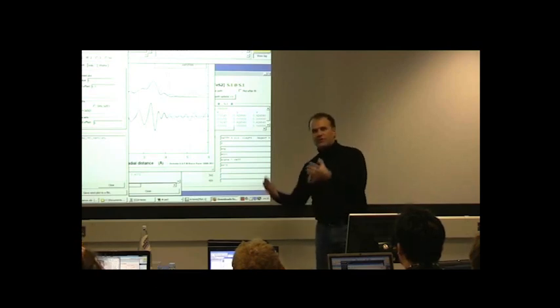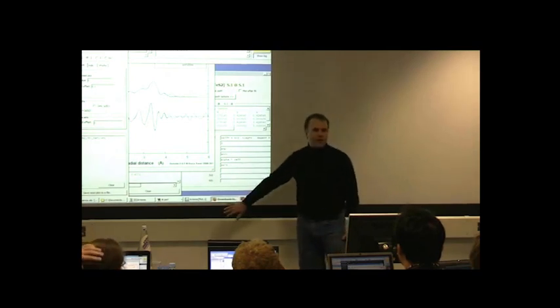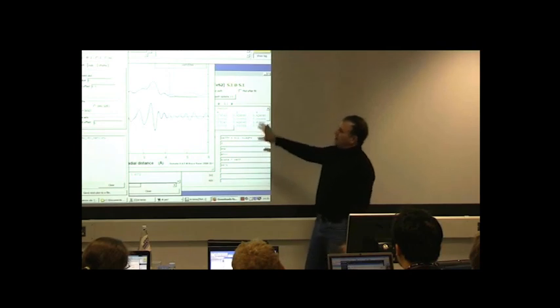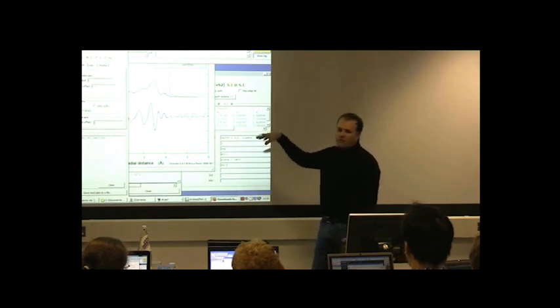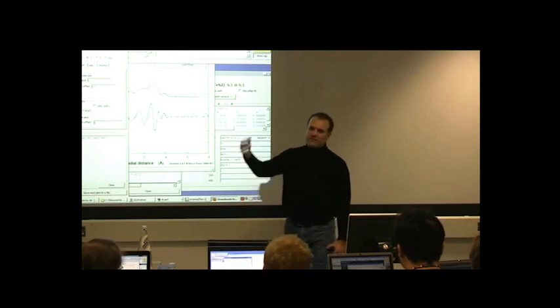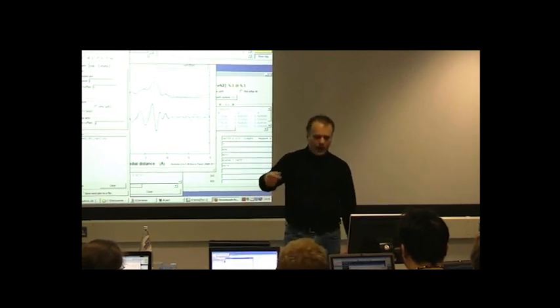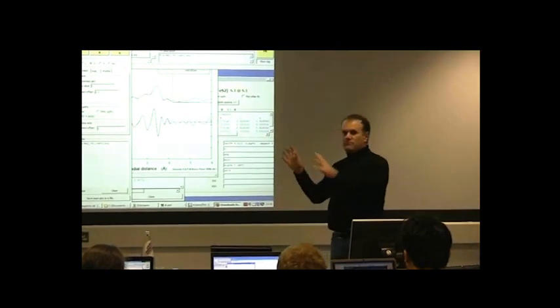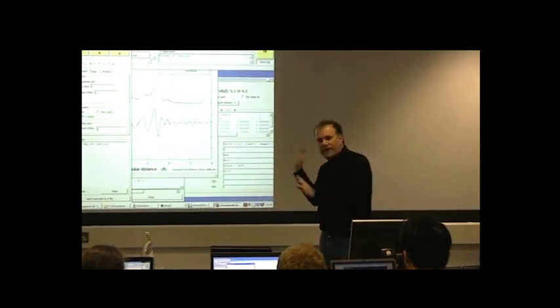Right, this is a teaching example. There are some things that are simple and well known about this, but if you can understand all the mechanics of doing the teaching example, you'll be much better prepared to dive into your real research problem. Using Artemis is big and hard. EXAFS fitting is big and hard. There's sort of no way around that.